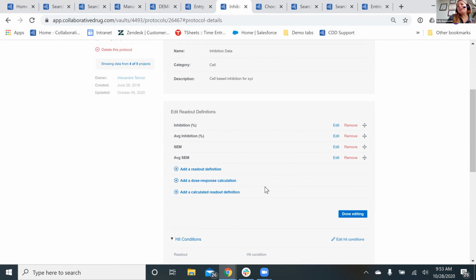Okay, I'm moving very quickly. Again, I will say if you want a full-fledged demo, maybe go through it a little slower and ask questions along the way, please feel free to contact me. I love talking about CDD Vault.